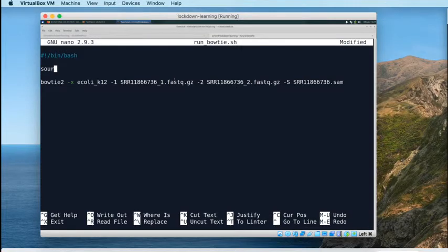we last wrote a script is how to activate a Conda environment from within a script, and that is you have to source your Conda environment first, which I believe is in, I believe it's there.